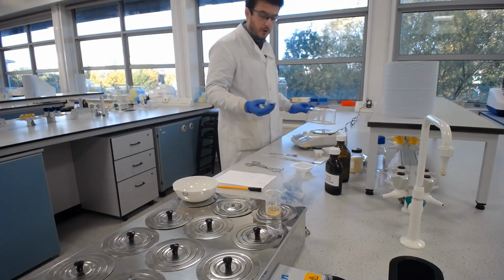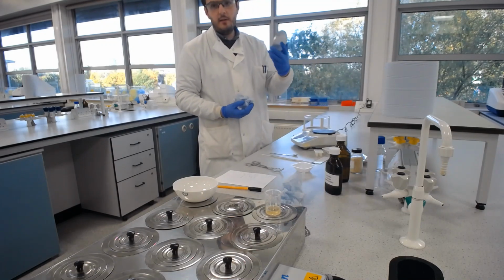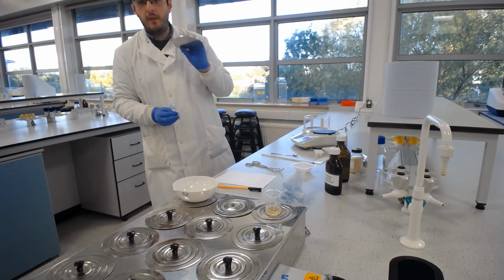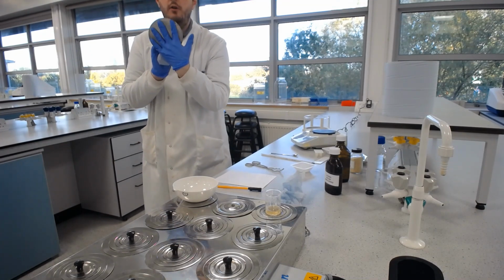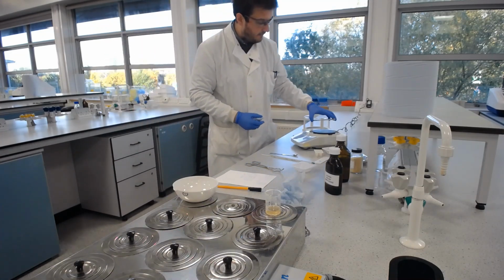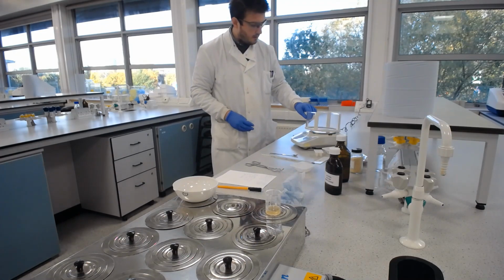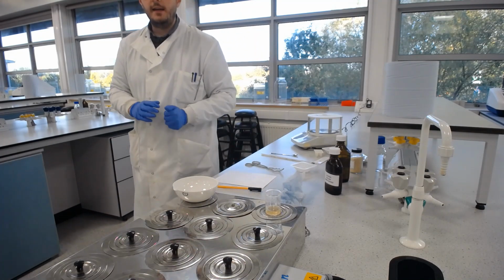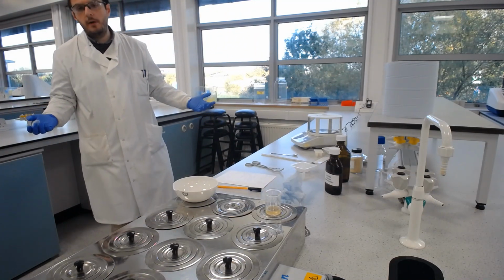You're not putting too much pressure on. If you need to clean the balance and put a lot of pressure on it, you just need to take the plate off the top. And then you can scrub to your heart's content without bending it. Make sure it's kept flat, so you can see I've got my hand across the whole bottom, and then I can clean it. Okay? That's the best way to clean the plate, and then obviously you can use a brush to get everything else off the balance. The reason we're so particular about that is because we want balances to continue to be accurate for a long period of time.